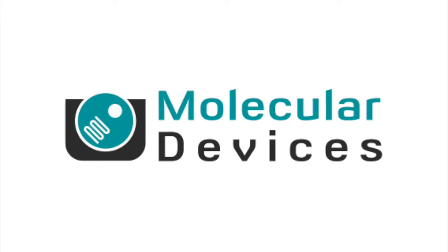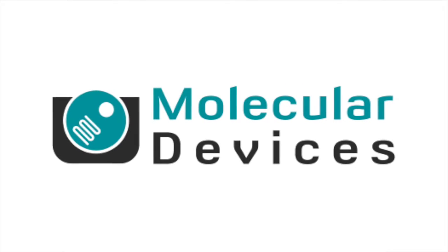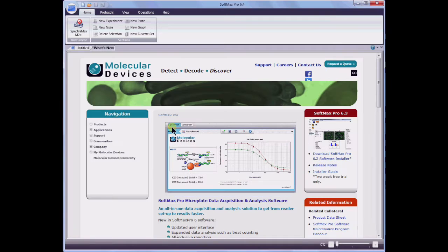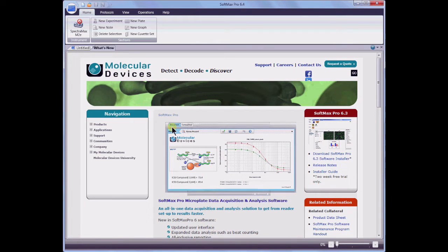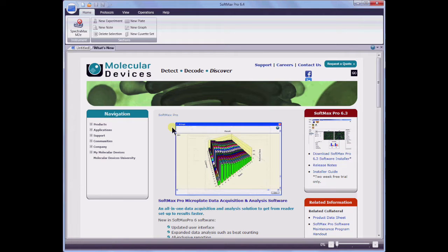Hi, my name is Crystal Berger with the Molecular Devices Technical Support Group. In this video, I will show you how to easily set up a plate read using SoftMax Pro Microplate Data Acquisition and Analysis Software version 6.4.